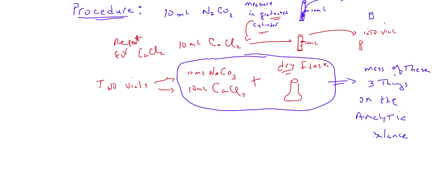Okay, and all this is going to be our mass before, right? Because nothing's happening. And we want to see if the mass before equals the mass after. I mean, that's the whole idea.